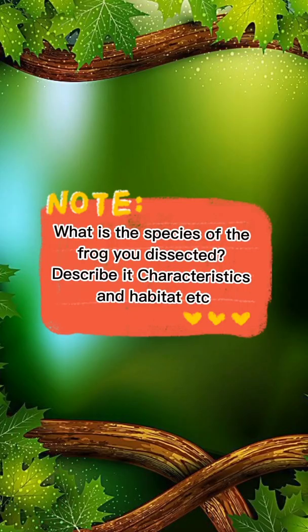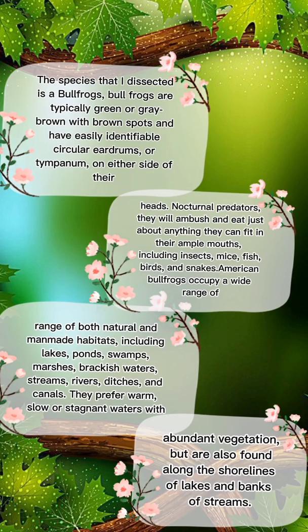And now, I'm done with dissecting the frog. What is the species of the frog you dissected? Describe its characteristics and habitat.